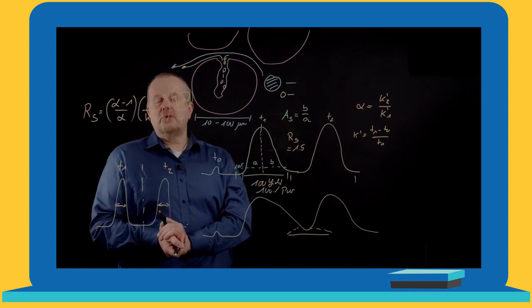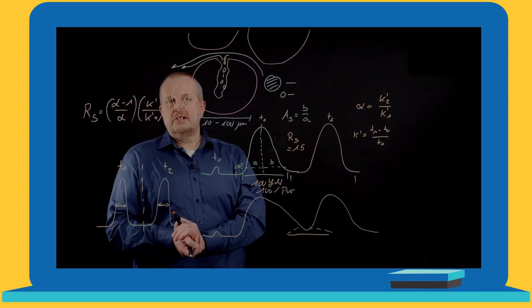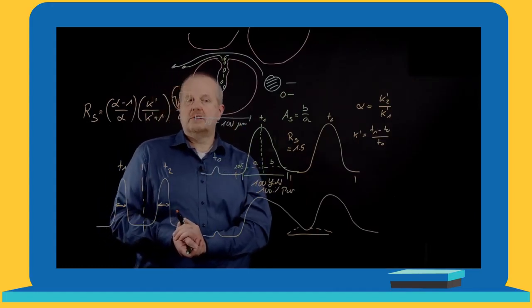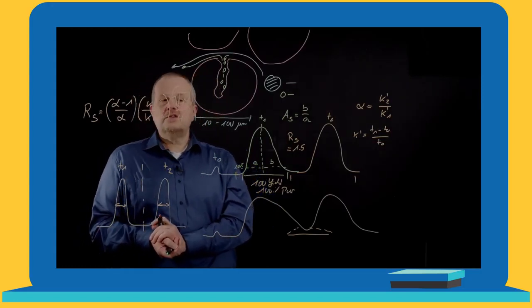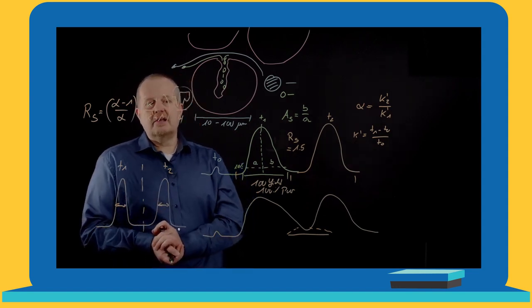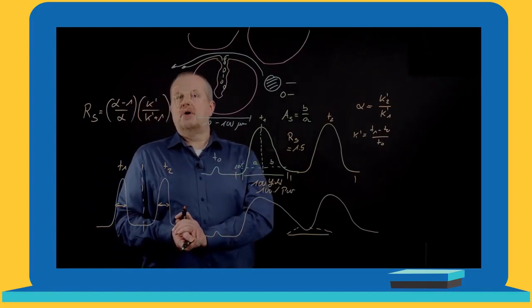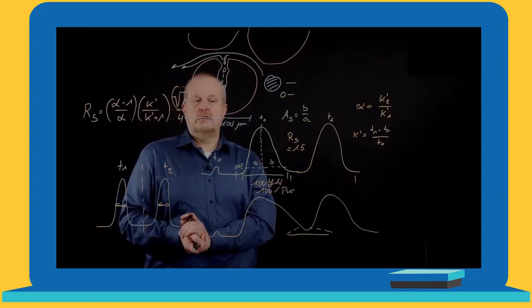That is, for example, what we do with our tentacle technology, which we use for Fractogel and Eshmuno, where we have a very fast desorption characteristic. Last but not least, to increase efficiency, you can go to smaller particle sizes. But have in mind, the smaller your particle, the higher the pressure drop of your chromatographic column. So this has a certain limitation.